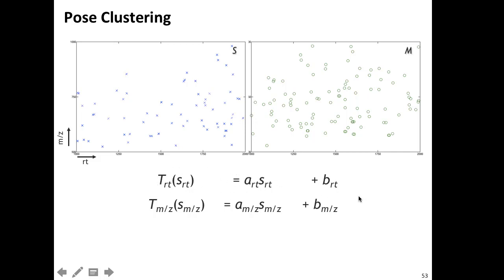If we're looking at retention time only, we can do that independently. We're looking for a global shift, B, and we're looking for some slope, A, that determines how we do the transformation. What you can basically do is test all pairs of these dots in a certain region, and incorrect matches will cluster all over, but the correct matches will sort of pile up at one position. It's a very efficient algorithm that can be run in under a second, and that gives you a good estimate of that. I can explain the details later on. For now, I leave it at that.